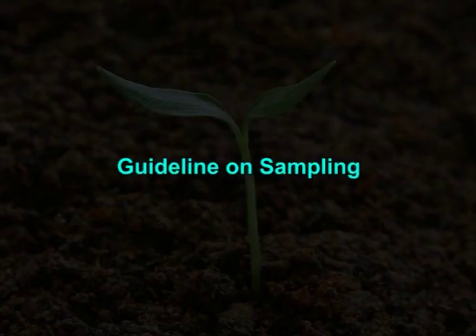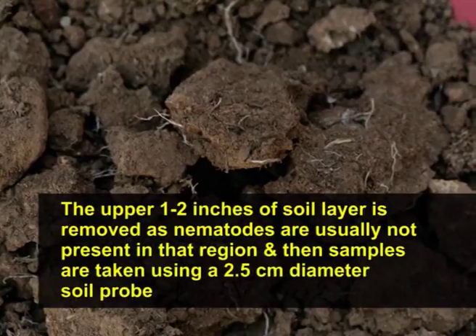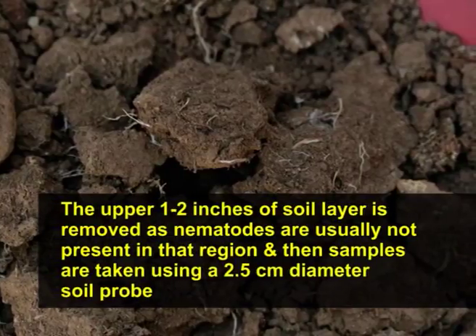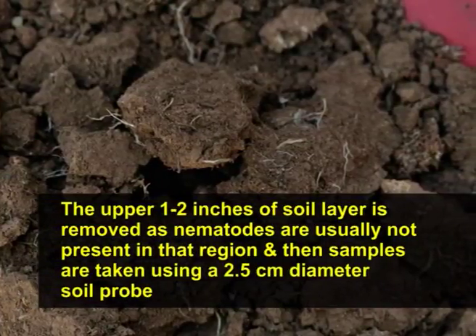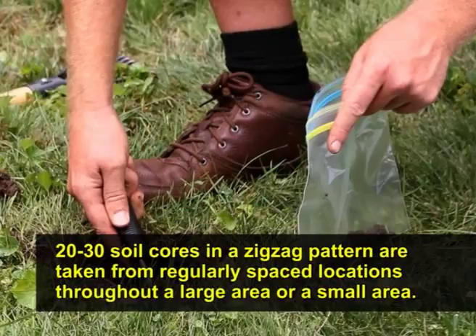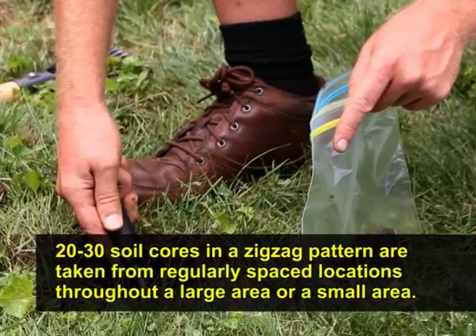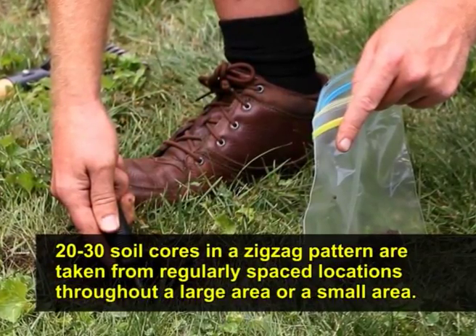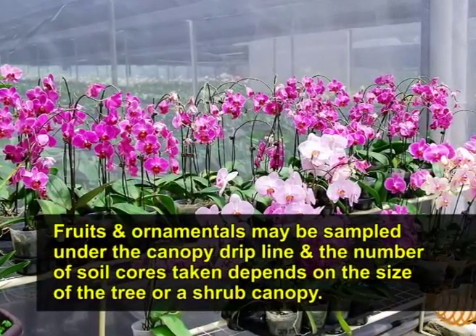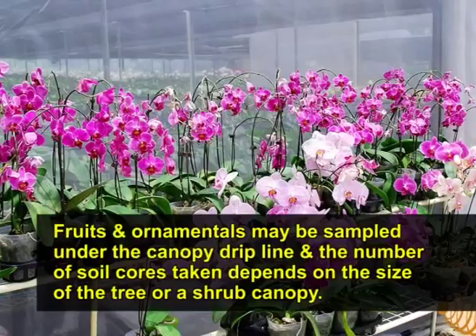The guideline of sampling. The upper 1 to 2 inches of soil layer is removed, as nematodes are usually not present in that region, and then samples are taken using a 2.5 cm diameter soil probe. 20 to 30 soil cores in a zigzag pattern are taken from regularly spaced locations throughout a large area or a small area. Fruits and ornamentals may be sampled under the canopy drip line, and the number of soil cores taken depends on the size of the tree or shrub canopy.